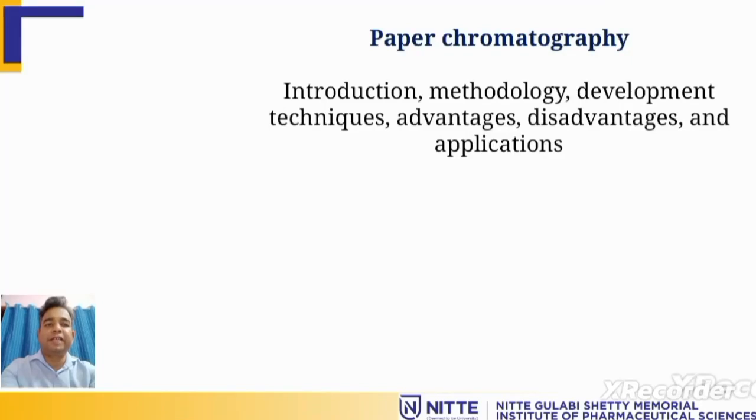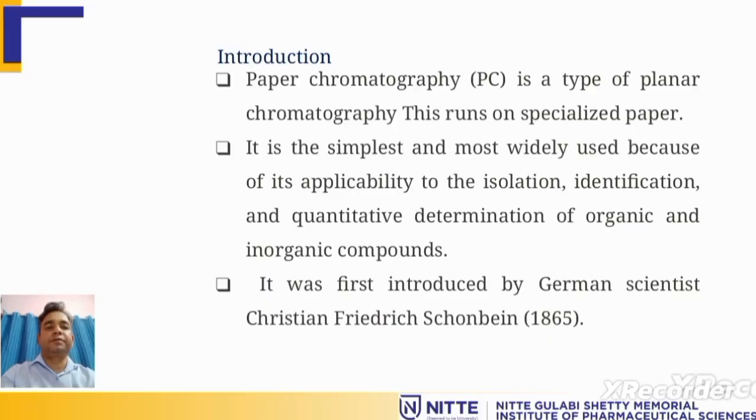Going to see the new chapter, paper chromatography. In this, we'll see about the introduction of paper chromatography, methodology, development techniques, advantages and disadvantages, and its application. So here, let us see how paper chromatography works. So, introduction to paper chromatography.